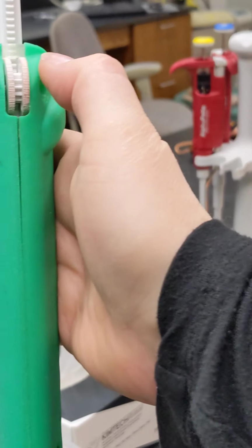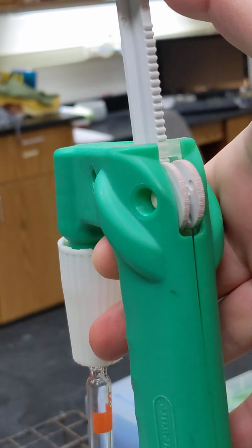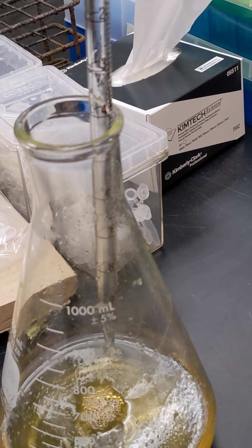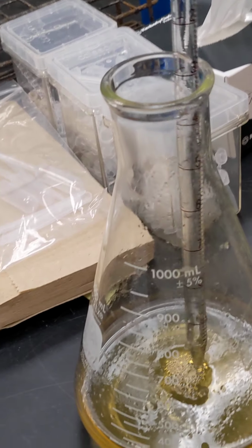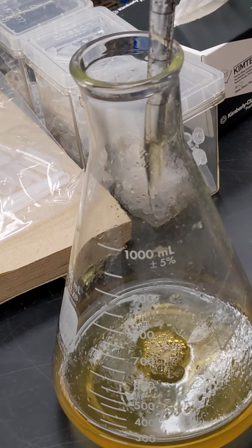And I do that by moving this little gadget right here. And then when I want to release that into my cylinder, I just push it down to expel that liquid. But of course, I would do that into my actual tube. Now I can do the exact same thing to make a slant, except I'm going to use less. So I'm going to use 6 milliliters of that agar solution. Put that in the sink for right now.